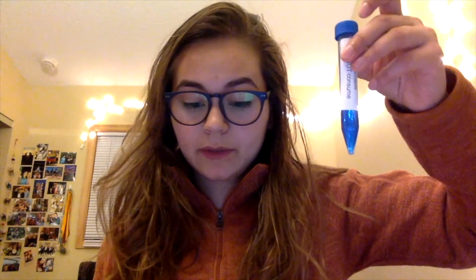Now we're going to prepare that ice bath. Just make sure that there's enough either snow or water to really cover the tube. We're going to take the rubbing alcohol that we made, and we're going to put this tube in our snow bath. Make sure that it's nice and chilled and all covered. That's our second step. Our third step is to prepare the DNA isolation tube.